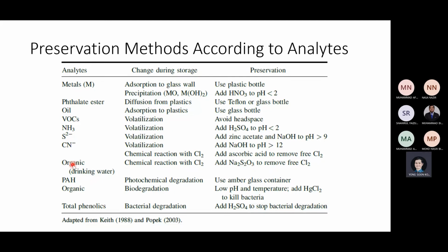So your organic matter will not be oxidized by chlorine. When chlorine is inside the water, it will break down this organic matter. Of course it will break it, and you will have a lower content of organic matter.